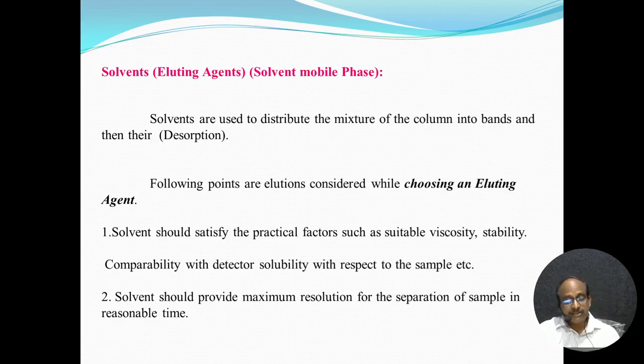Another one is that the solvent should always provide the maximum resolution. That is a good solvent. You have to use that, called a good eluting agent. The solvent acts as a mobile phase. That is a good mobile phase. Whenever it satisfies all these things, then only you call it a good solvent, a good mobile phase. The solvent should provide the maximum resolution for the separation in a reasonable time.